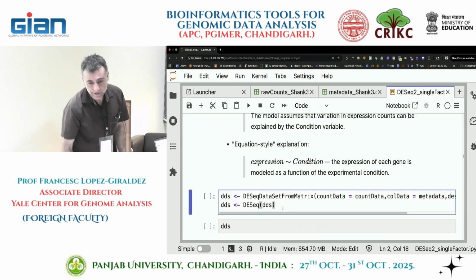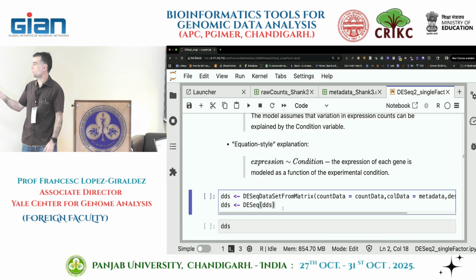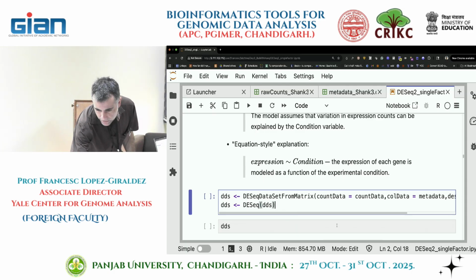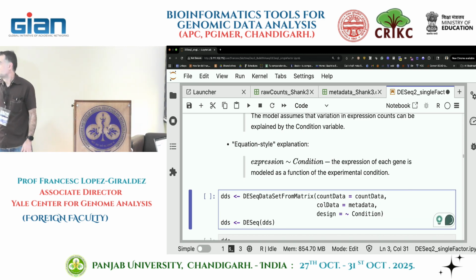Okay, what we finally expected to run, right? You don't see it here, but let's do the proper version. In R, for example, you can break lines. If you break them in functions after a comma, it's not going to be a problem reading it.